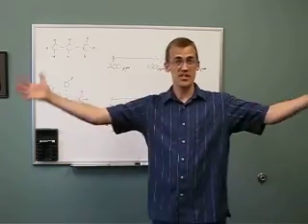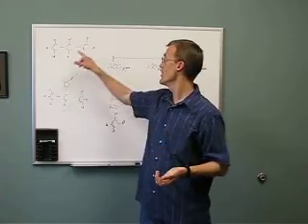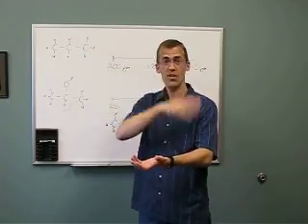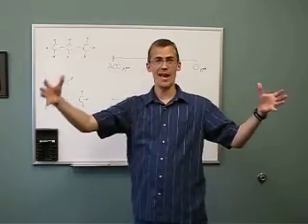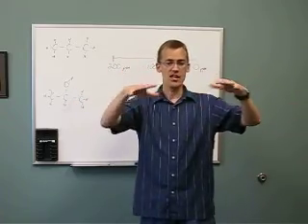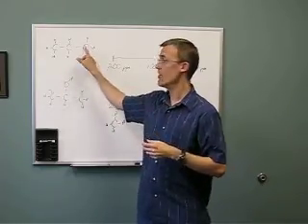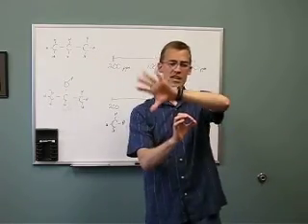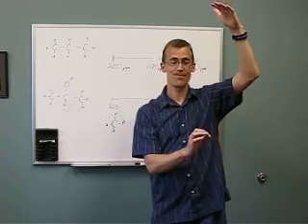It is inside this powerful magnet, but between it and the magnet are the electrons of the carbon and the hydrogens around it, the other carbons, these other atoms attached to the molecule. They all have their electromagnetic fields, and they essentially work as a buffer. So this nucleus has some other stuff buffering the effects of the magnet.